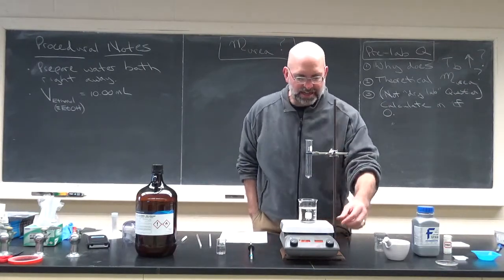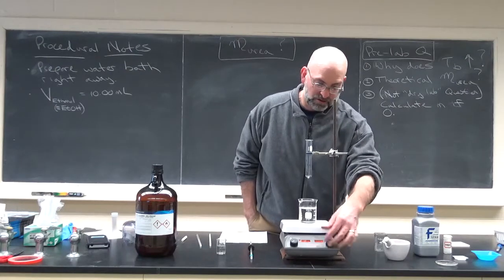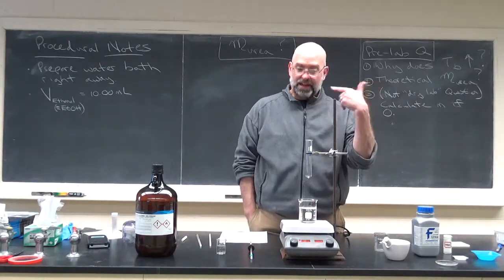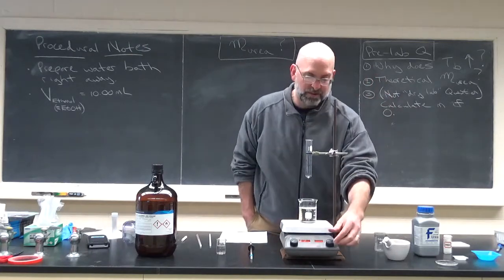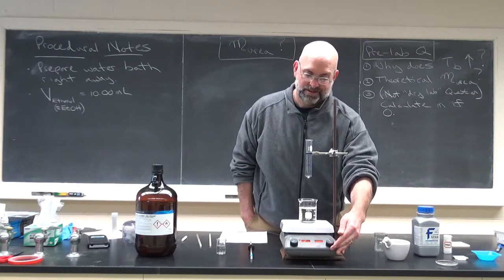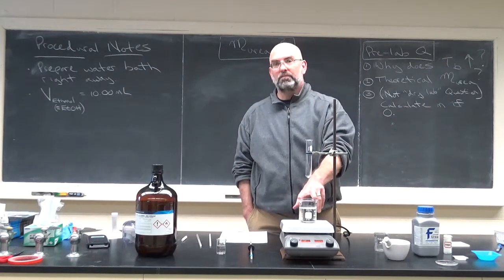And then you want to heat it. I'm just going to mimic this. Make sure you use the heat feature, not the stir feature. You can put a stir bar in here. That'll heat it more efficiently if you want to, but you really don't need to. You don't really have to crank up the temperature on this, because you do not want to boil this water.